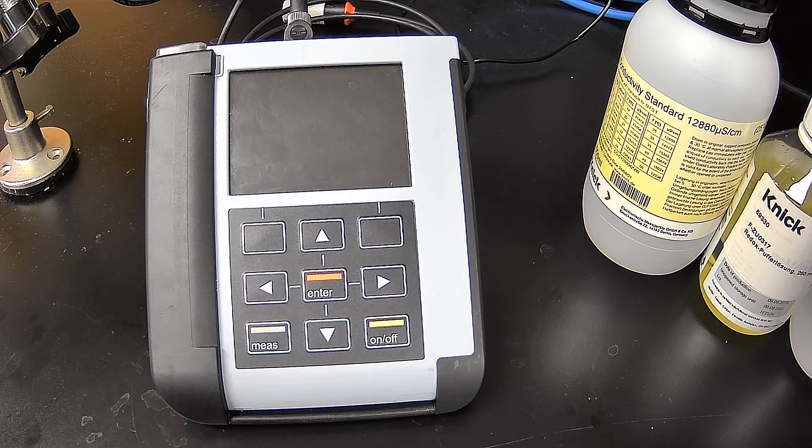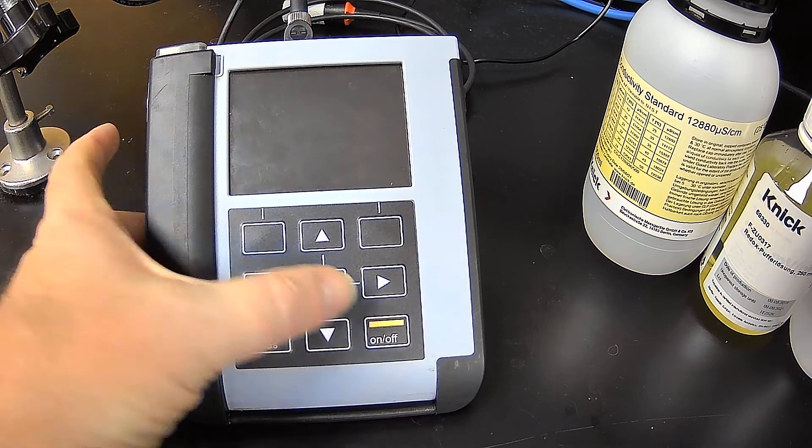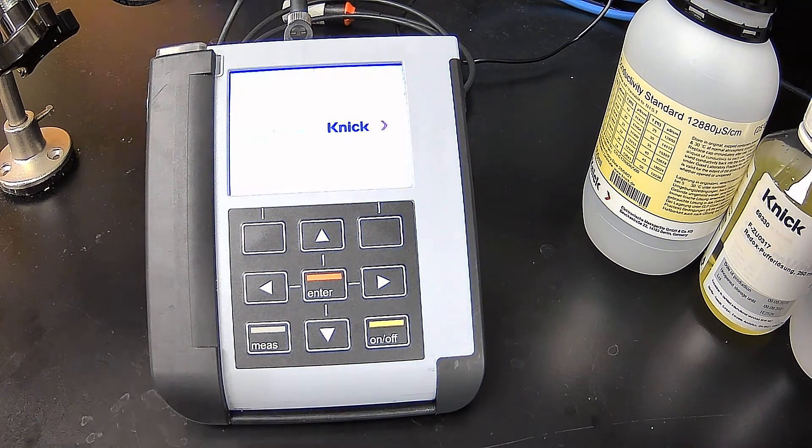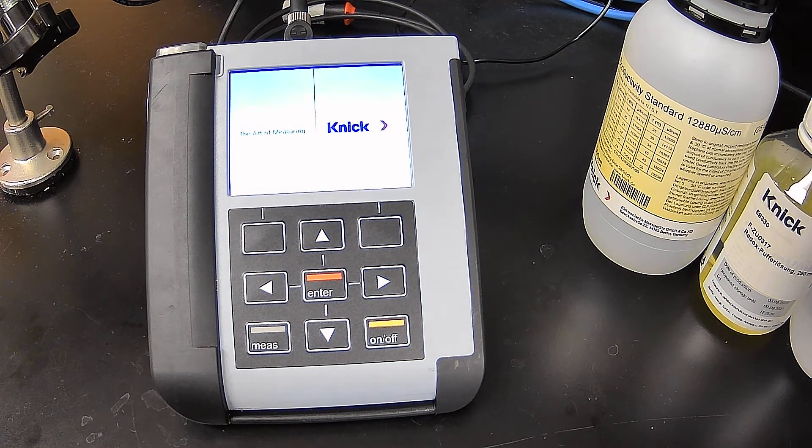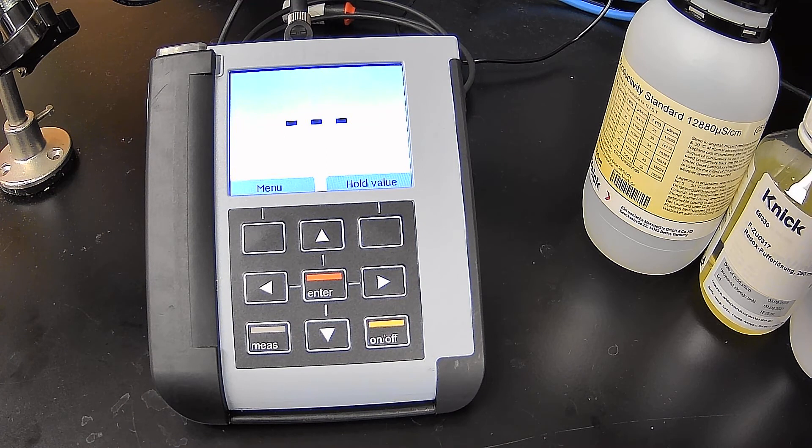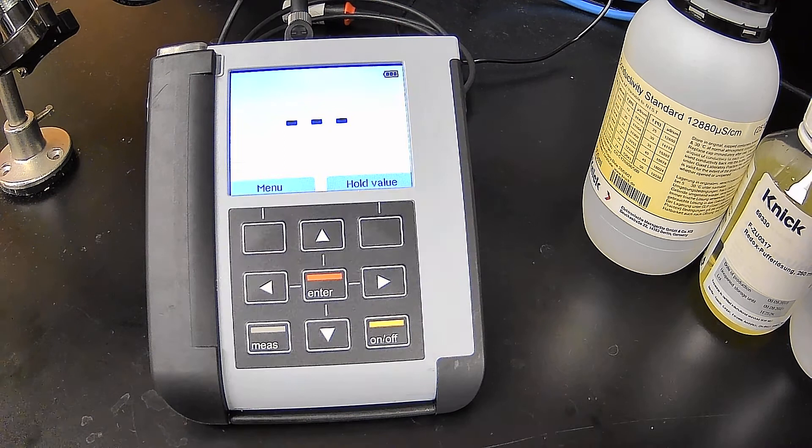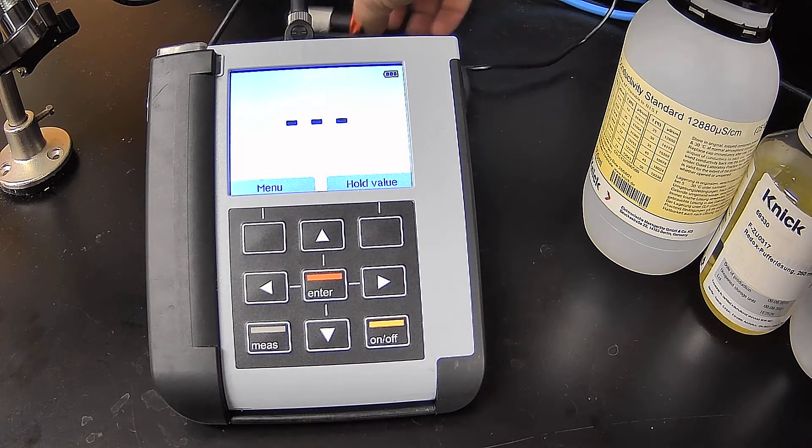But again, we're going to talk about the SE615. So what you see here is the 907. We're turning it on and there's no electrode currently connected to it, so it's showing us our battery life. We're fully charged.